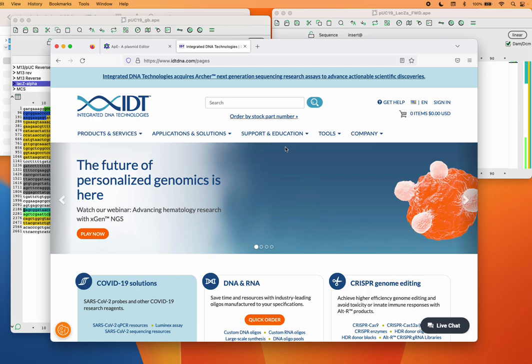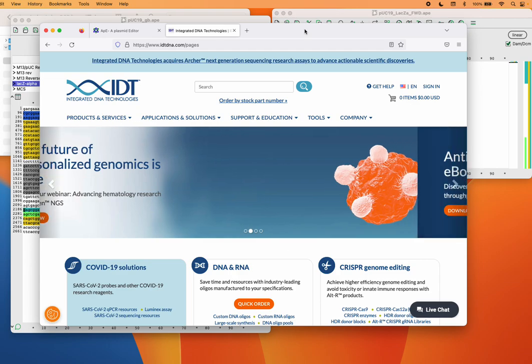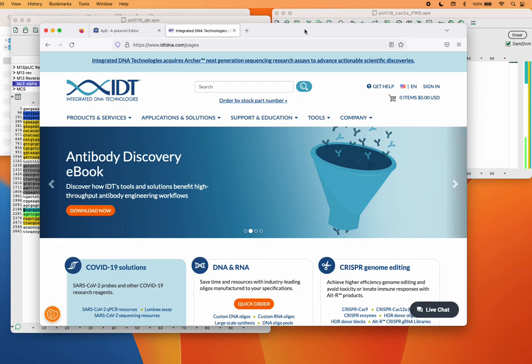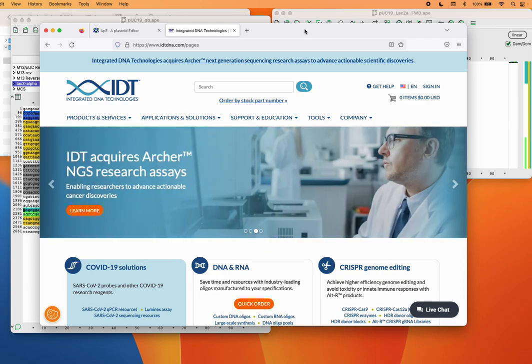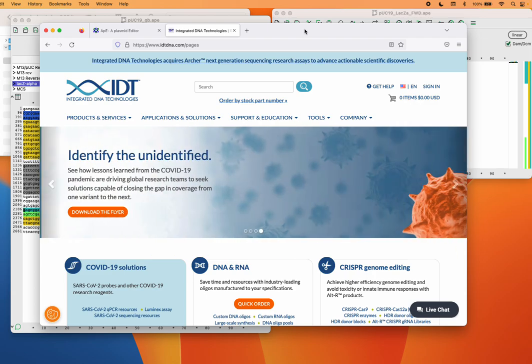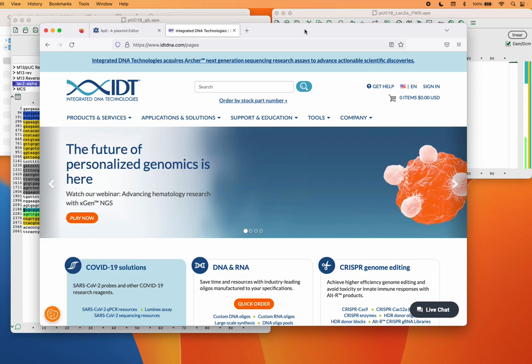Now, there are some drawbacks. So biotechnology, as you've probably been hearing, is a very powerful technology. And so often to get DNA synthesized, you need to be a company, or maybe you are in a school, right? So you won't be able to order these if you're at home. There's a very low or no chance that you'll be able to order primers directly to your home. It's a safety measure that's put in place so that nefarious activities don't happen. But yeah, it's as simple as that.